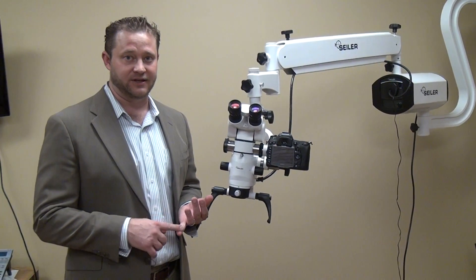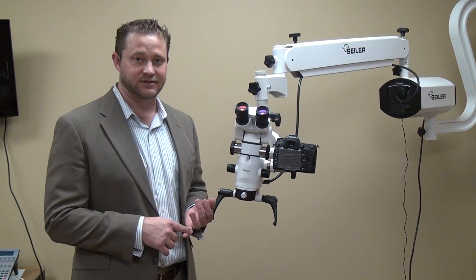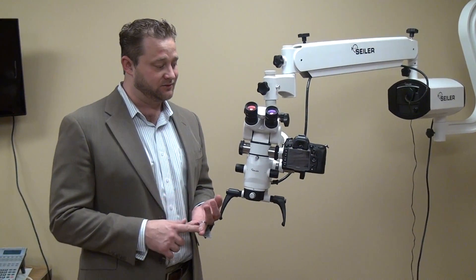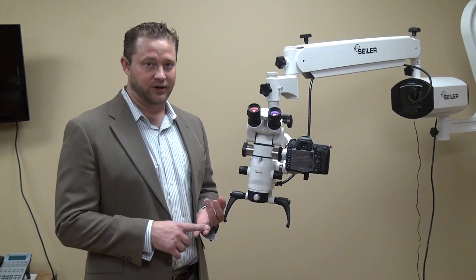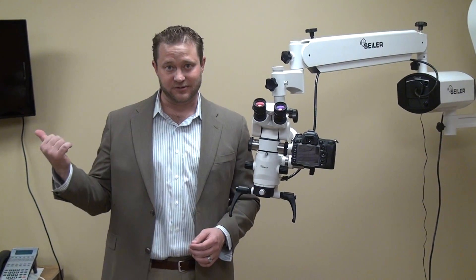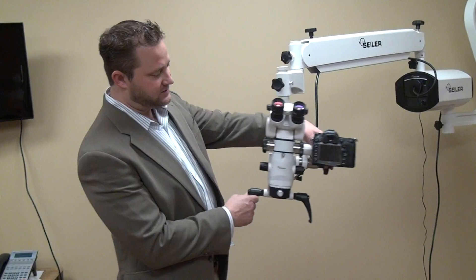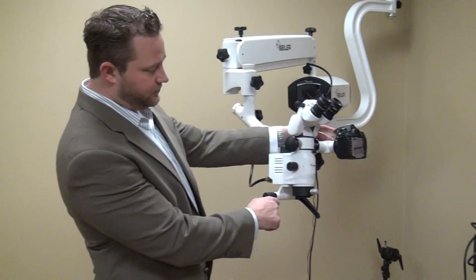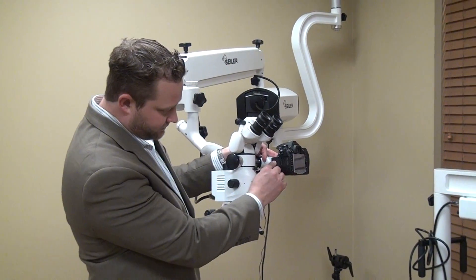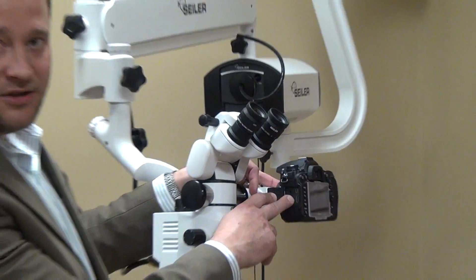First, of course, you're going to be able to take really nice single-shot images at about 20 megapixel. Secondly, you can actually run live HD video from the camera to the monitor. And the way that's done is all the new DSLRs, they each have a little HDMI, small HDMI output.